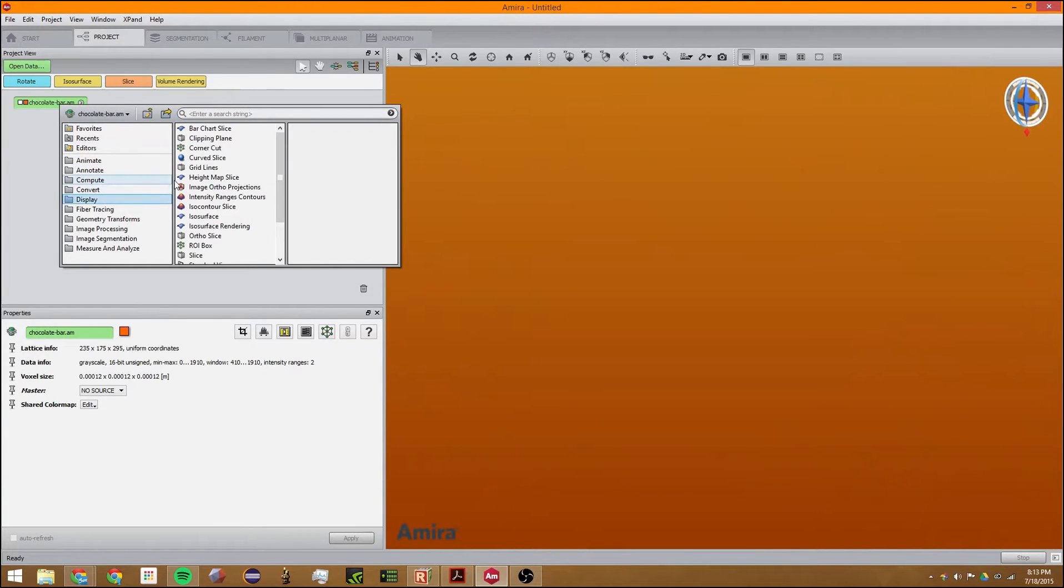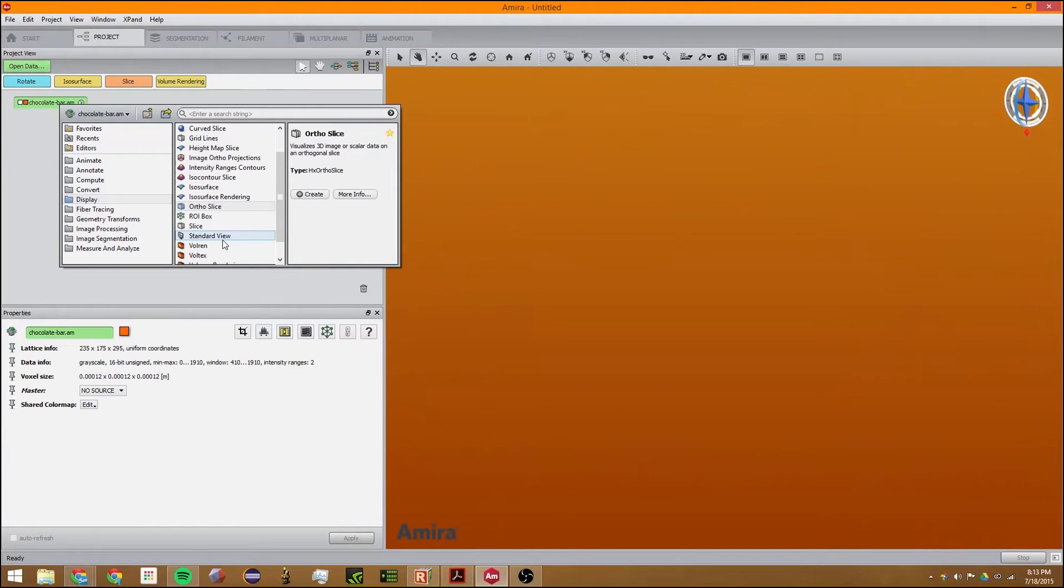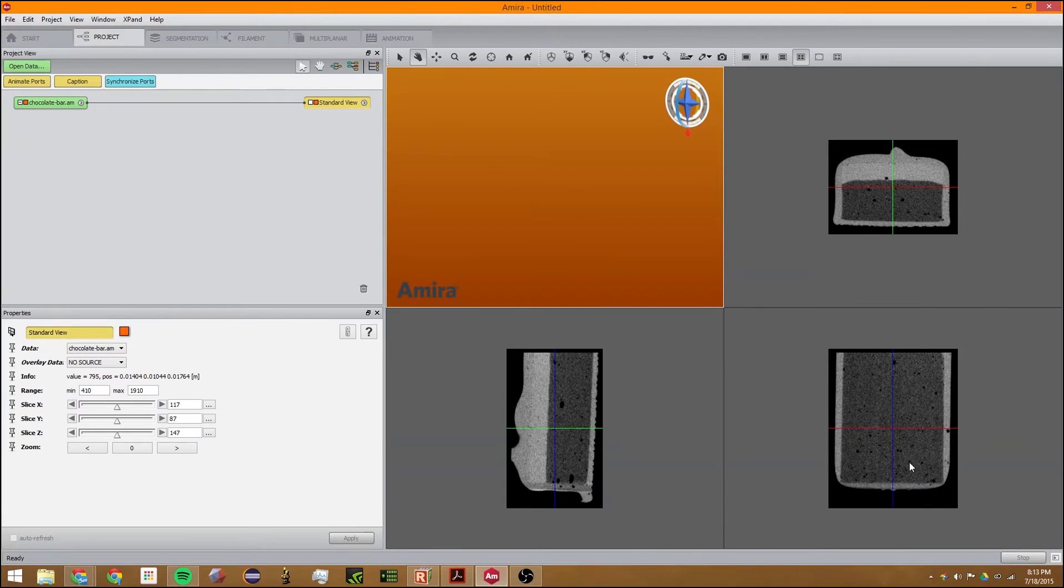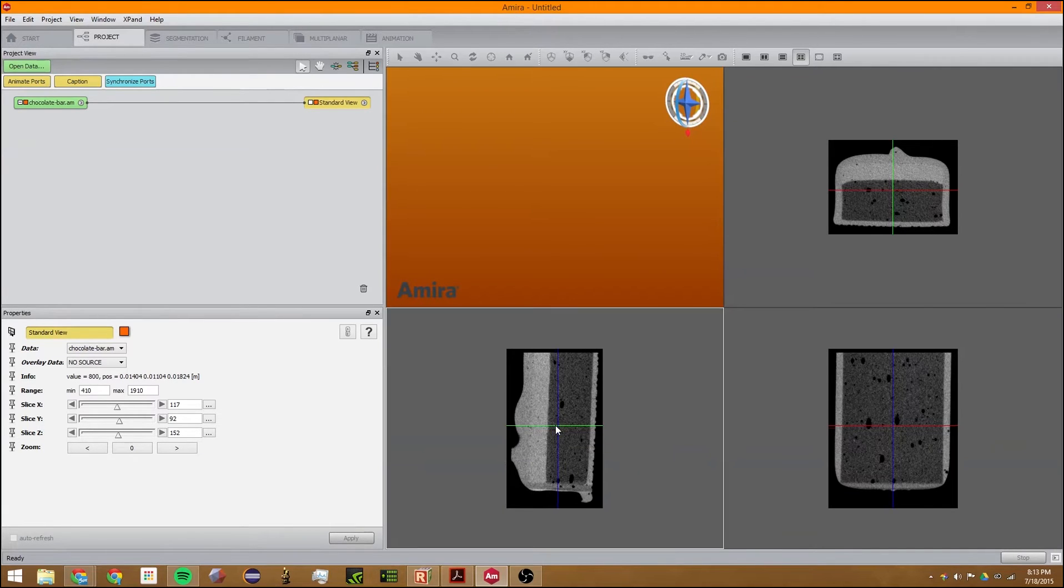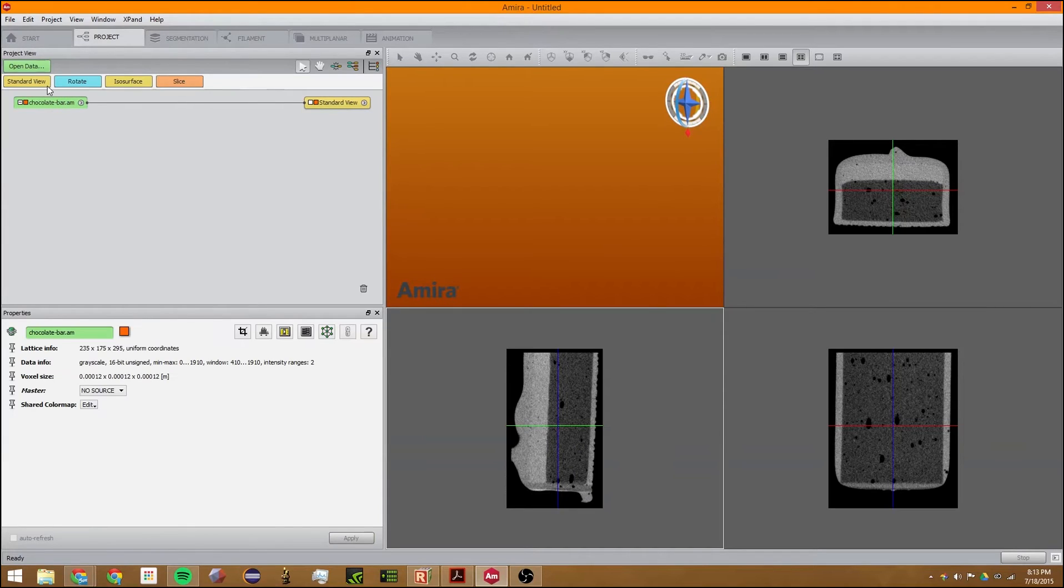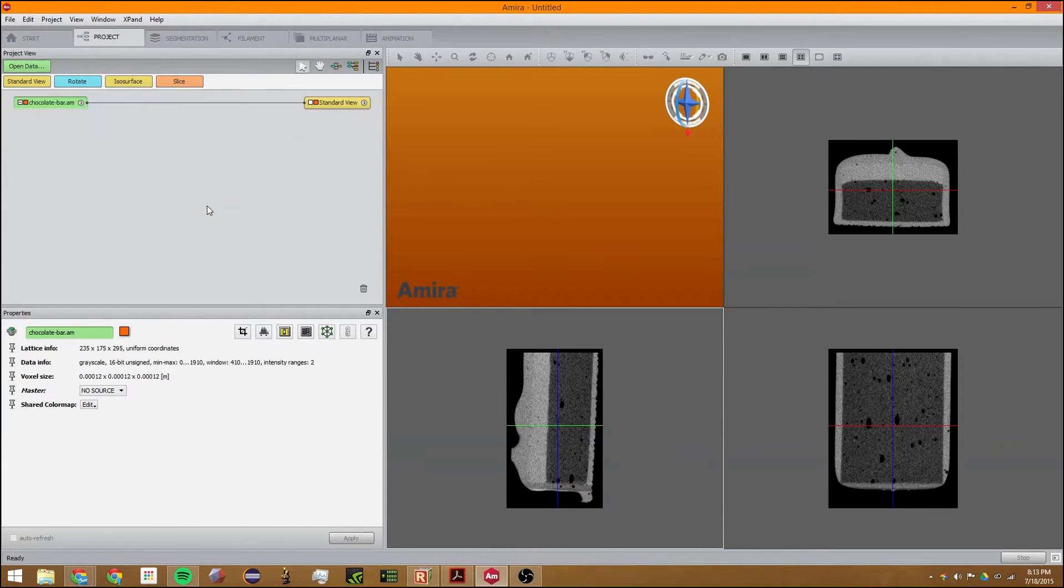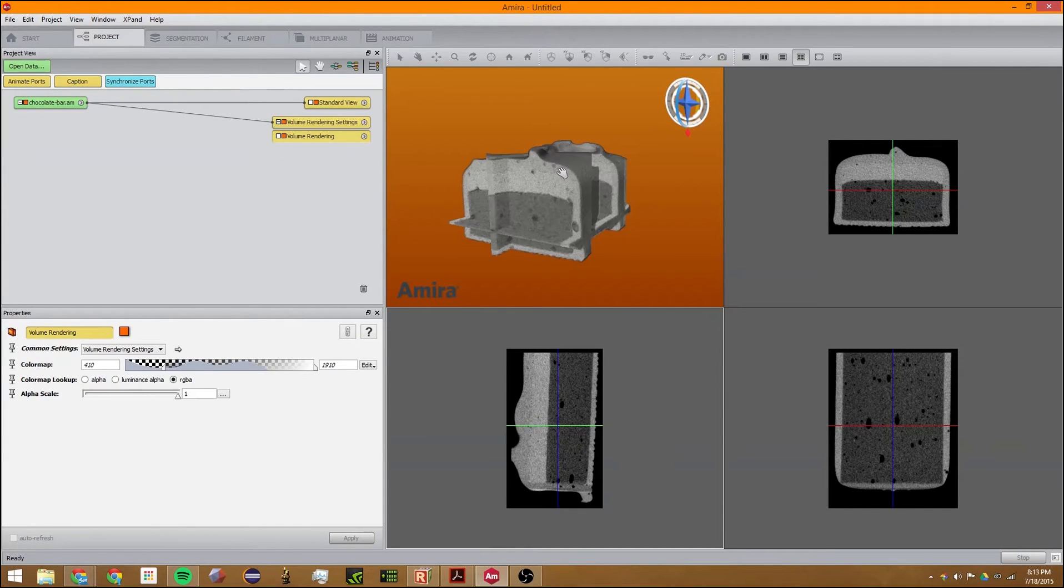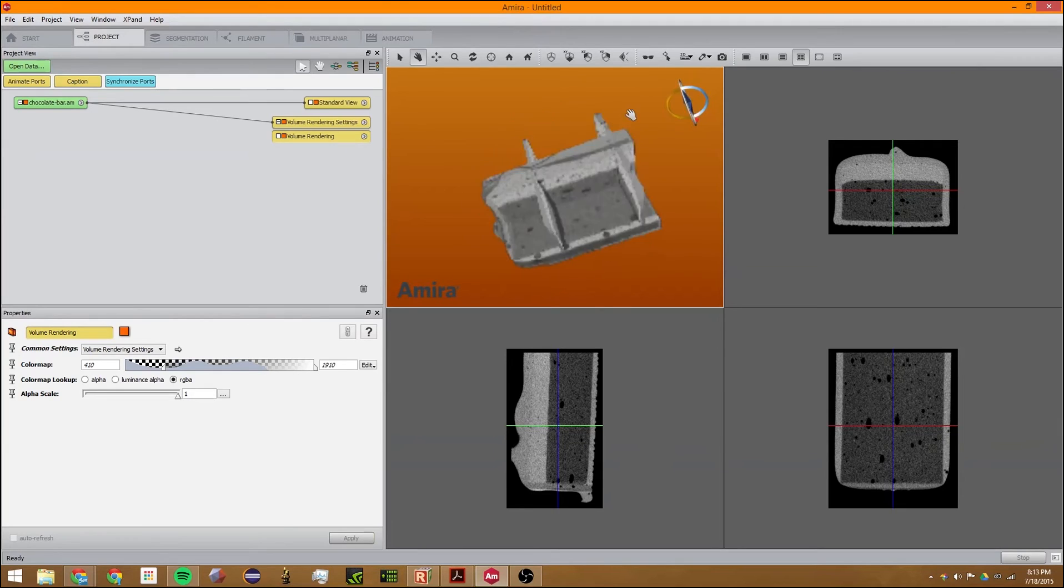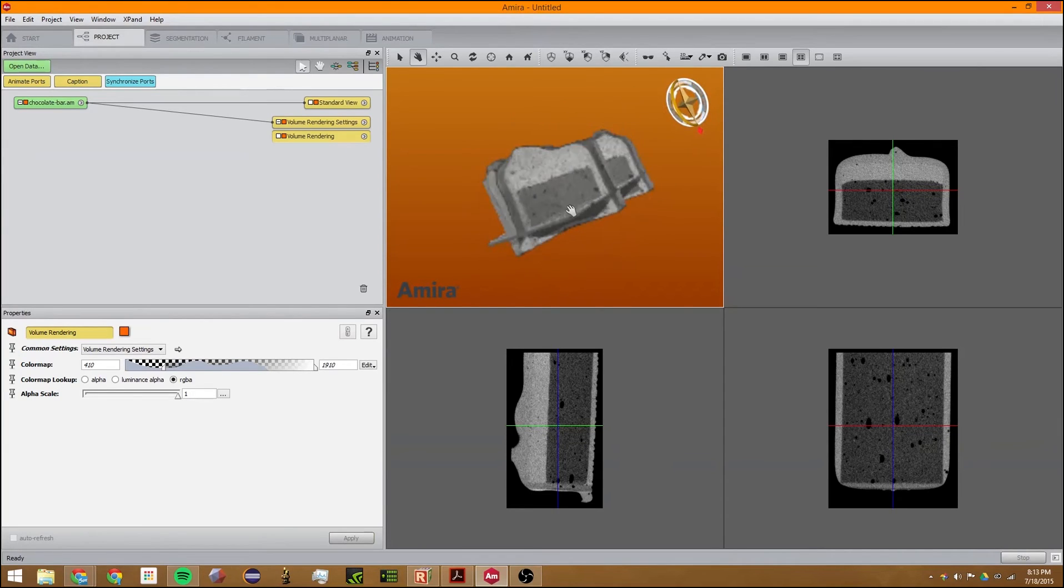We're going to go to ortho standard view, which will give you three different ortho slices of the same thing. If we add a volume rendering, we can see it like this.